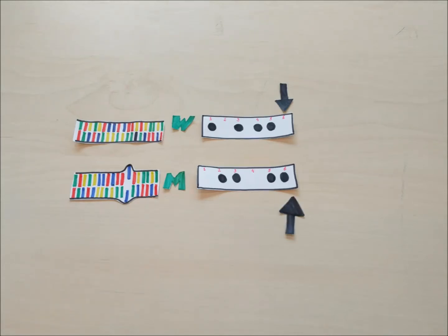Only sample 6 has a homozygous mutant allele and would be affected by the disease.